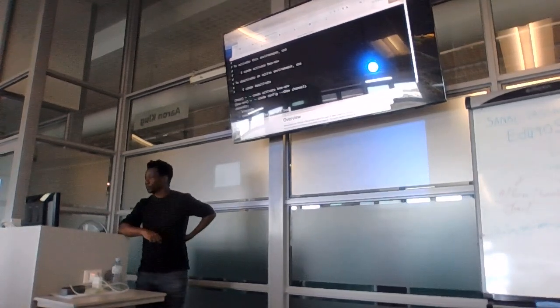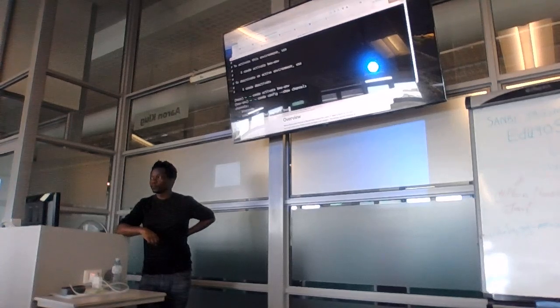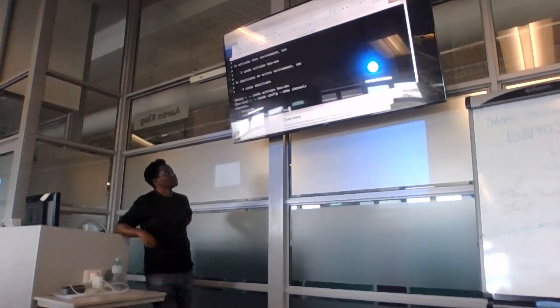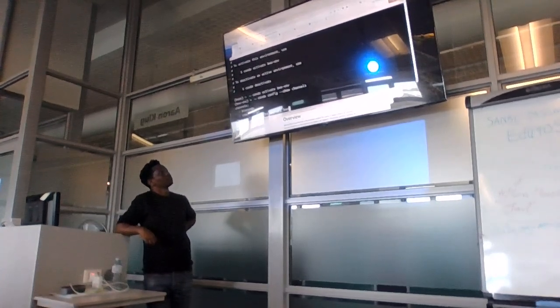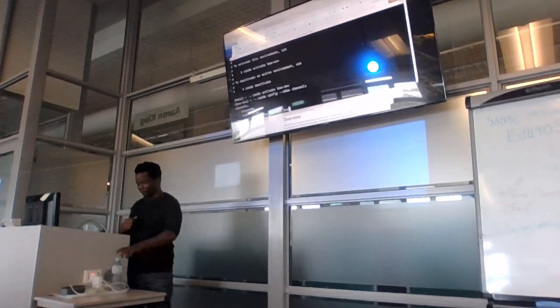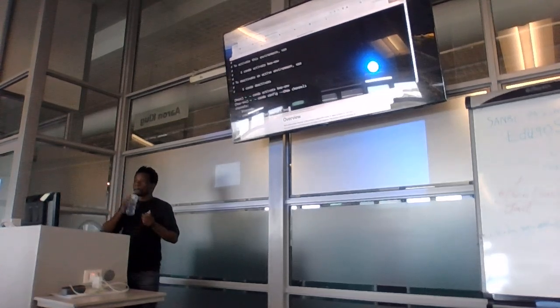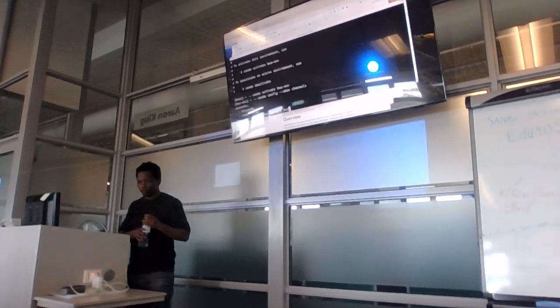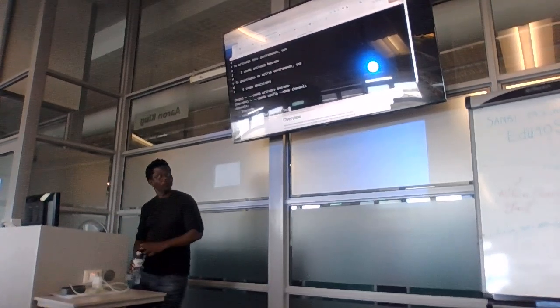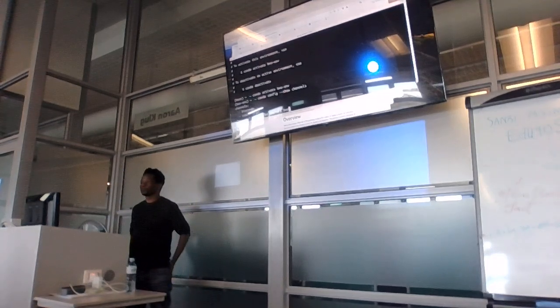And the reason we have the environments is so that if I put one package in one environment and I put another in a different environment, they are already separate, and there will be no interference. So now it's mamba install BWA. BWA is coming with all its software into its own environment. He has called it BWA env. So that env will be like the room with all the necessary things required by BWA.